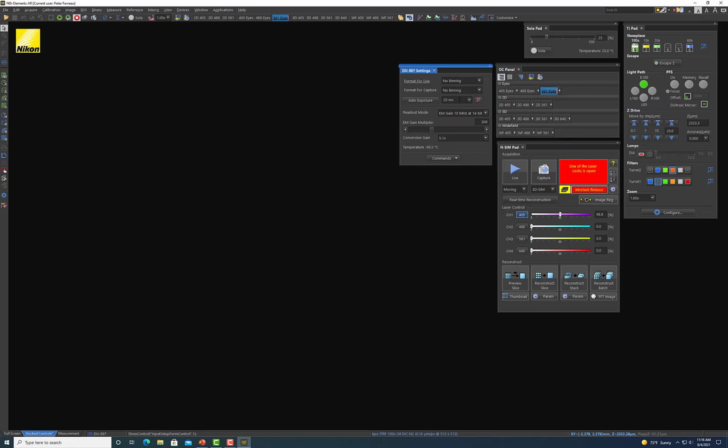But of course, you're exposing your image to a lot of light in that time, so it's worthwhile to find a happy middle ground between maybe a really longer time and a shorter time where you can really optimize that exposure time so you don't harm your sample. And again, I think 20 milliseconds is a pretty short one. You really start getting into longer times when it's like 500 milliseconds to a second. But if you need that to acquire an image, it's totally fine. You just have to be aware of the caveats that go with acquiring longer images as it pertains to photobleaching and things like that. The other thing you want to go ahead and adjust whenever you're optimizing your settings is this EM gain multiplier. Basically, it's just gain.